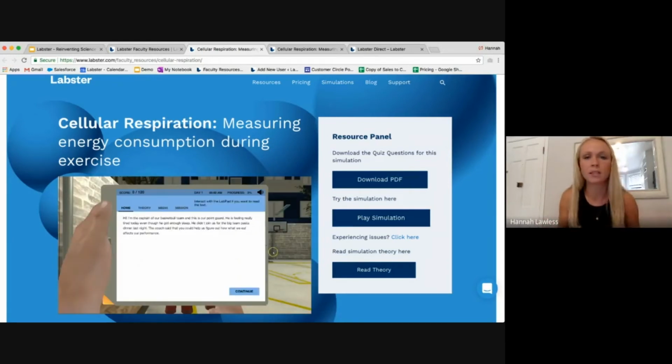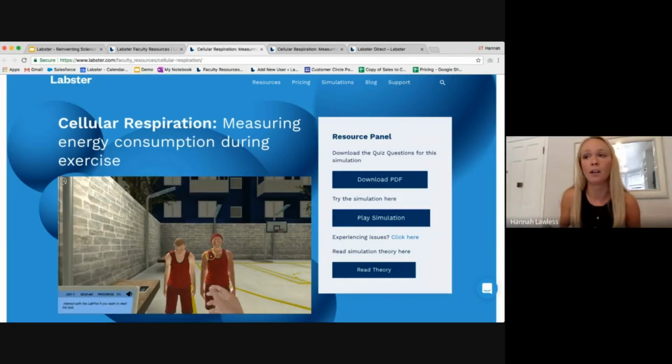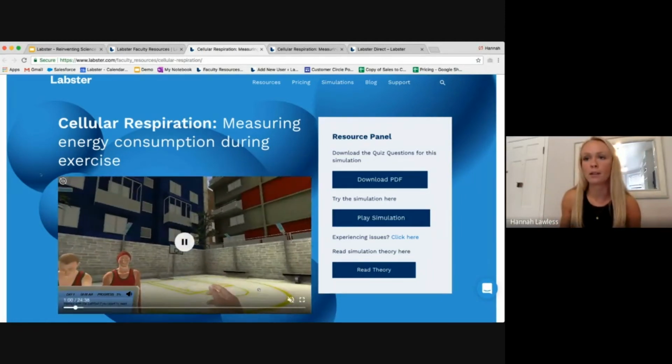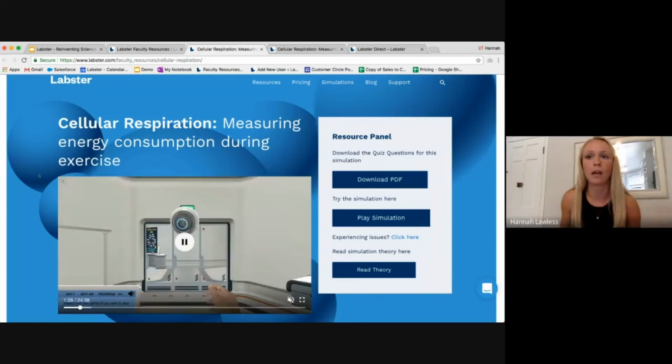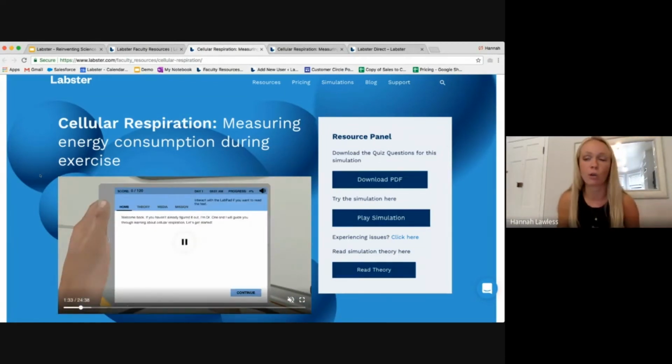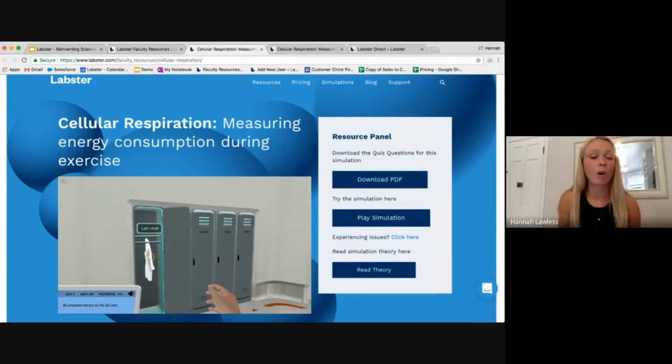So we're going to take their blood samples back to the lab and figure out why that is. After we've collected a little bit of information from them, when we head back to the lab, we are going to have to prepare for the lab as we would traditionally. So we're going to go over into our locker and grab our lab coat. From there, we're also going to have to put on our gloves and head into the lab.